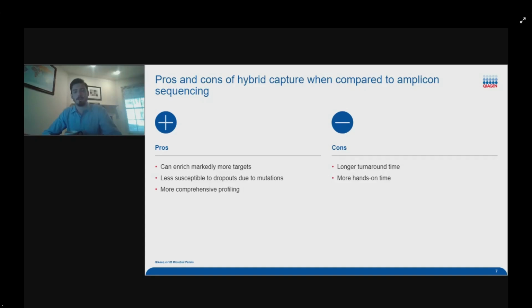So we have two different SARS kits, the QIAseq SARS-CoV-2 Primer Panel and the QIAseq Direct SARS-CoV-2 kits. Those are both amplicon based, whereas the respiratory panel is for 89 separate viruses. And so those 89 separate genomes are such a large amount of targets that amplicon sequencing kind of breaks down, and hybrid capture sequencing is really the best method there.